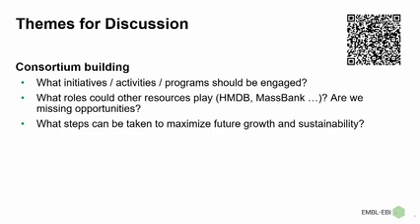Hi, I just had a few comments. So in terms of resources, one thing that could be really interesting is to reinforce the creation of reference materials, because we have this wonderful NIST material that is actually expanding. We have, I think from Avanti, in terms of lipidomics, this yeast total, yeast polar, metabolic, and this is really nice, but I think we really don't have enough. And having, for example, a cell polar extract, some kind of very standardized material that people could just put into their cohorts, into their sample sets, so that when we upload data to repositories, it would be easily identified, we could trace them back.